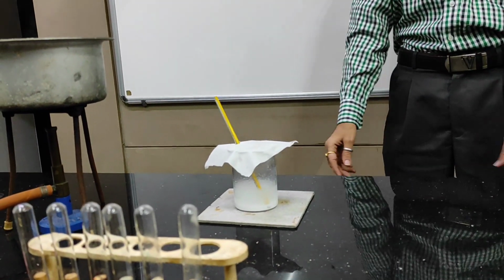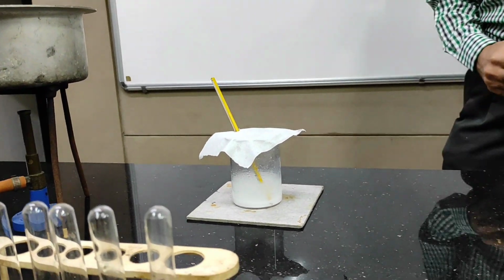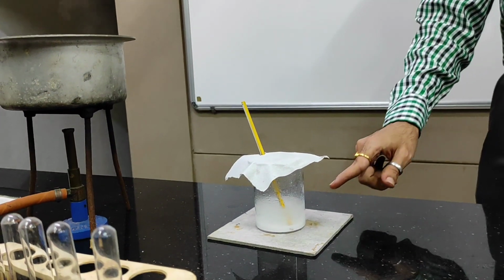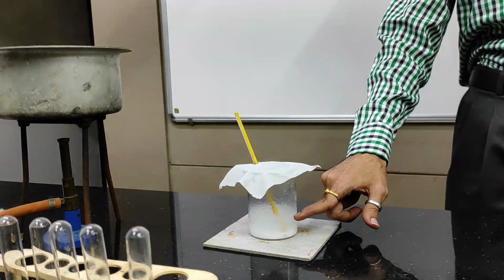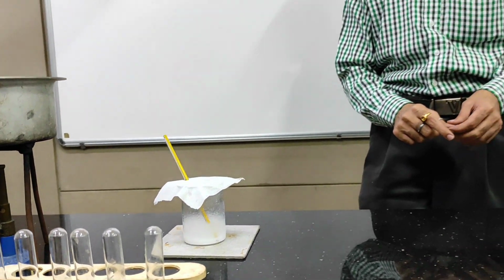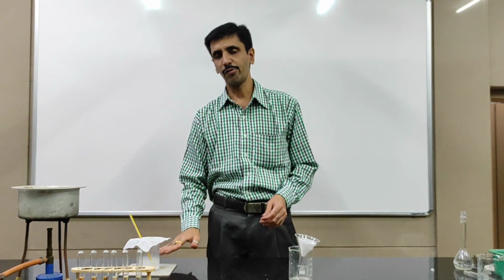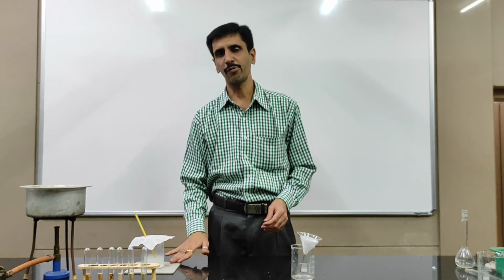See what happens is, I already told you the purpose of digestion theoretically. Now you can practically check that all the precipitate of barium sulfate, the white precipitate, settles down, and the clear solution is at the top. And you also know, my dear friends, the composition of that clear solution. Oh yes, it's going to be NaCl. So let us cool it for some time, and then we can proceed to the process of filtration.